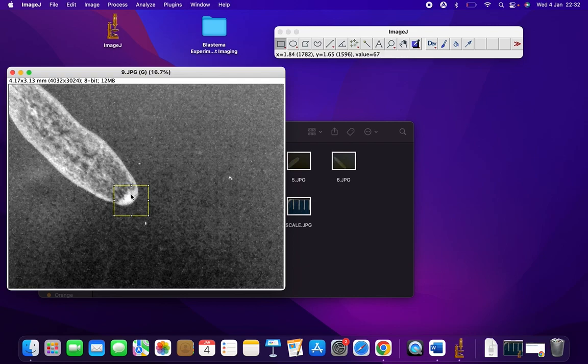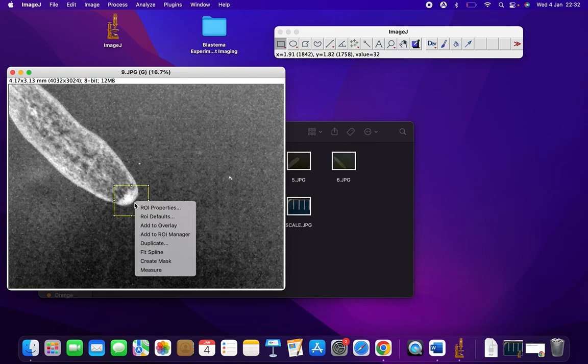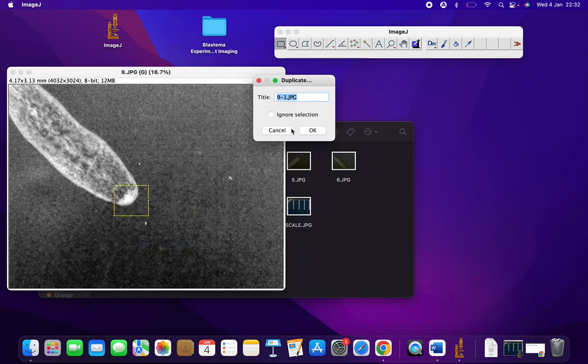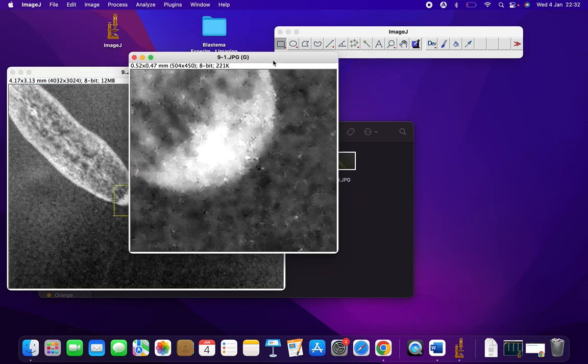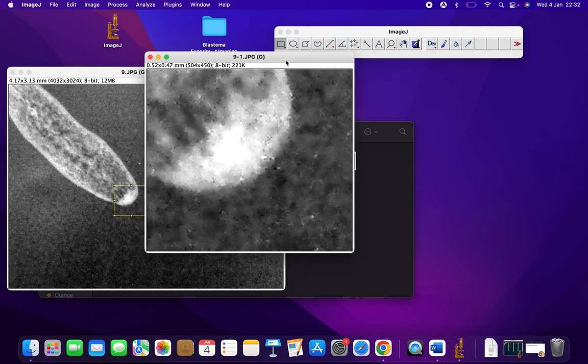Then double-click on it and press Duplicate, and press OK. Now the duplicated image is the image we will edit from now onwards.